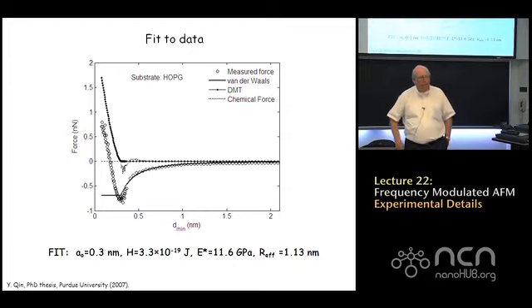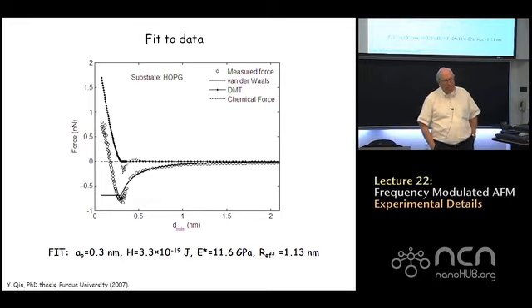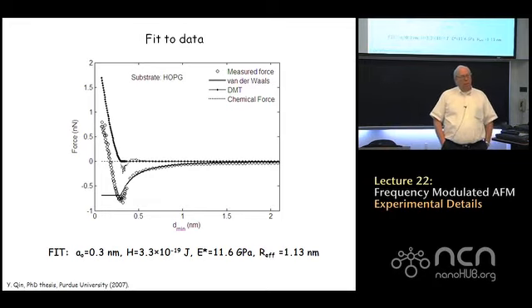Yeah. And how much vacuum? Well, we could do a whole lecture on ultra high vacuum technology, but you're basically talking 10 to the minus 10 torr. So if you have a surface of metal in air and you somehow clean it off, within microseconds there's a monolayer of air molecules that coat it again.